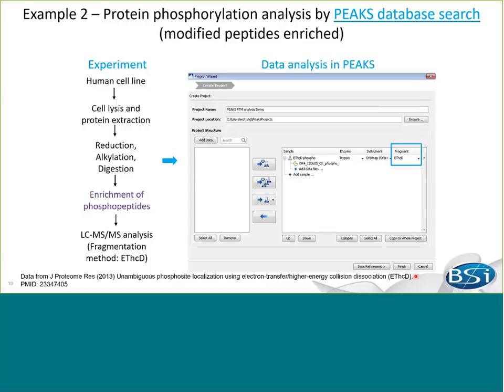The reference paper information is provided below. So now we have added the ETHCD fragmentation method in PEAKS, which will be available to users in the next version.